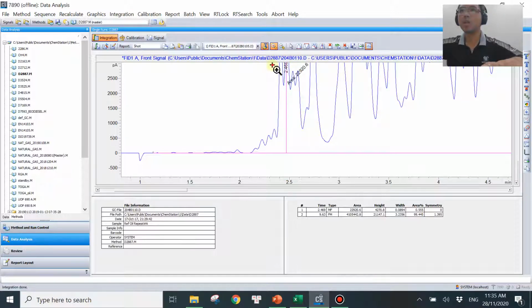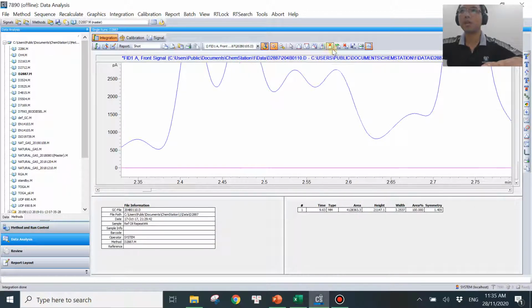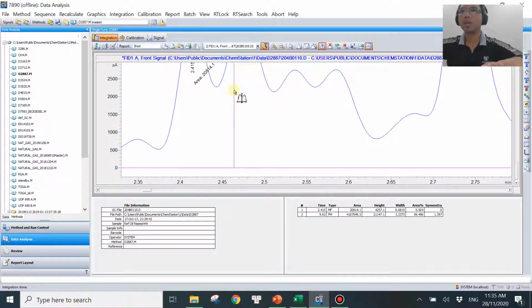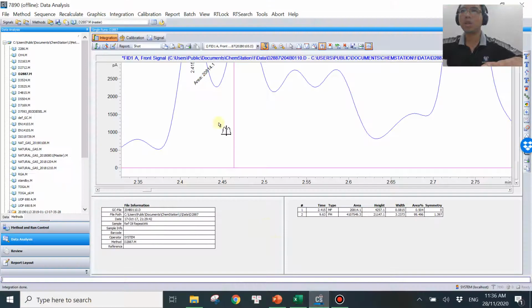So let me zoom in a little bit more so that we get a little bit better view of this one. So here I get 22,000. I need to go back a little bit further. So remove. I can go from here. Here you go, 20,800. Very close, right? We are very close to this. We need 20,641. So let's try to go a little bit further.